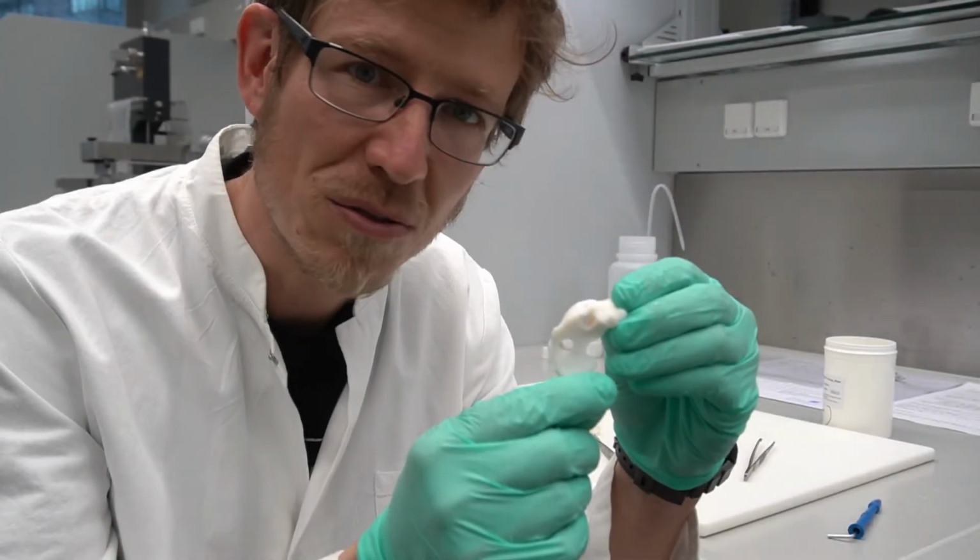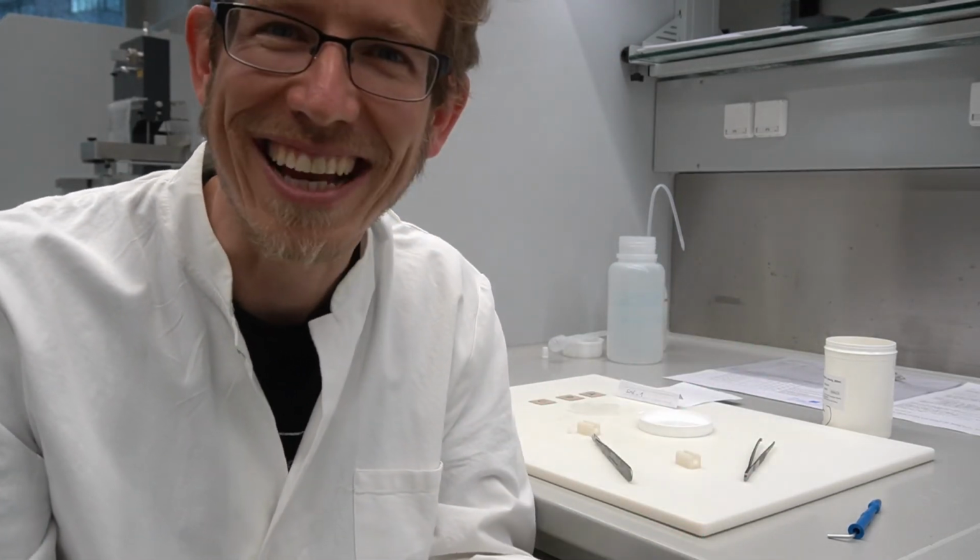Meniscus from a sheep. Nein, das stimmt ja gar nicht. Das ist ein Schwein.